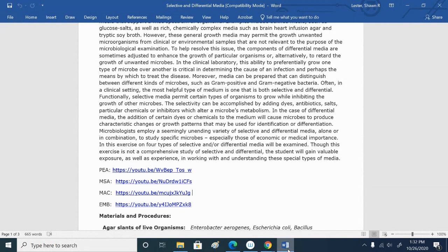And although she mentioned Streptococcus pyogenes, we would never use that because that's a pathogen, so we wouldn't give you guys that one to use. But normally you're only ever going to use the MSA for staph. There are other bacteria that can grow on it, especially certain gram-positive bacteria, and they may ferment mannitol, at least a little bit. But primarily it's used to differentiate Staphylococcus.